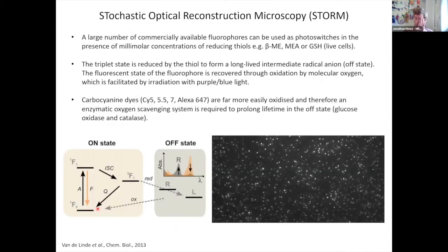Another localization technique which is commonly used is called STORM or dSTORM. And this doesn't use fluorescent proteins, it actually uses organic dyes like Alexa 488 or Cy5.